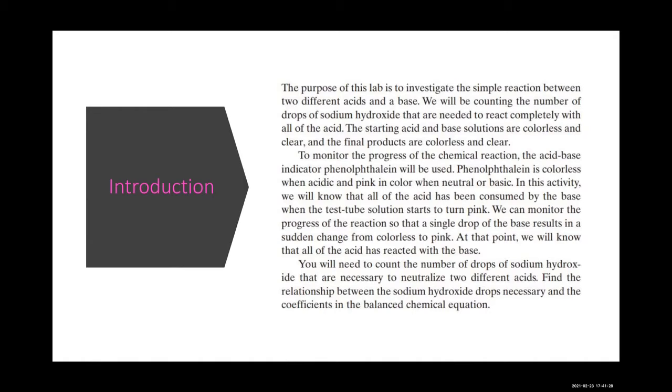You will need to count the number of drops of sodium hydroxide that are necessary to neutralize two different acids. Find the relationship between the sodium hydroxide drops necessary and the coefficients in the balanced chemical equation.